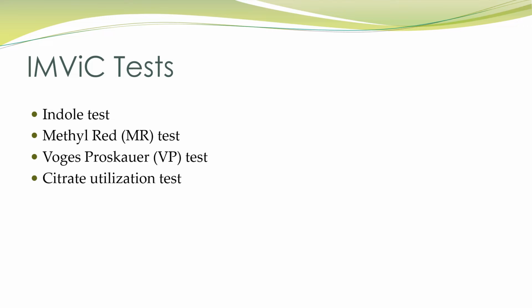One is gelatin hydrolysis and another one is casein hydrolysis. Finally, the IMViC test, that is the Indole test, methyl red test, Voges-Proskauer test, and citrate utilization test. Today, we are going to discuss the IMViC test in depth.